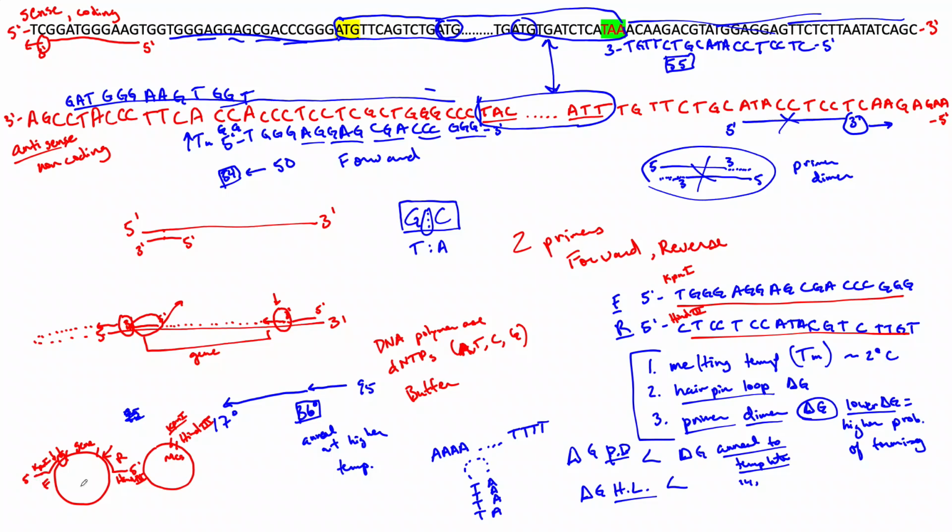If I put my cut sites on the 3' end, then you would see a primer that looks like this, where this part would anneal to the template DNA, but the cut site wouldn't anneal. And so the DNA polymerase would attach here, and it wouldn't have anything to copy. So you can't put your cut sites on the 3' end. You have to put them on the 5' end. So I'm going to look up what the KPN1 and HinD3 sites are, and I'm going to write those sequences onto my 5' ends, so that the primers will now have cut sites on them.